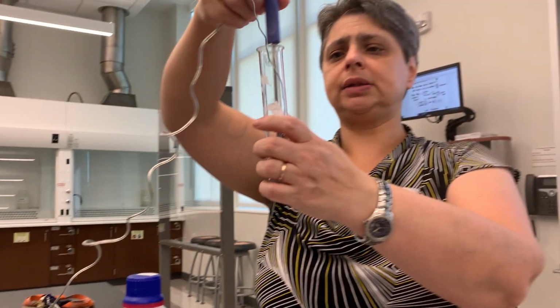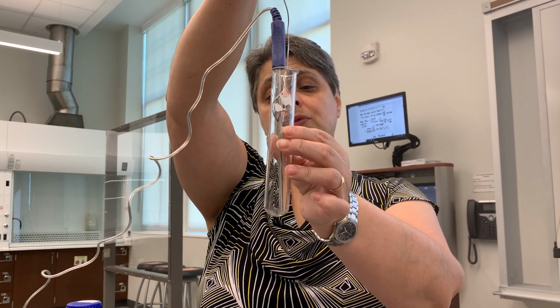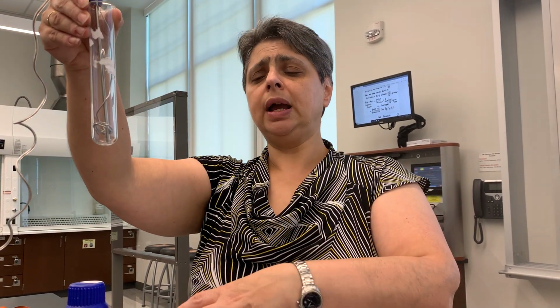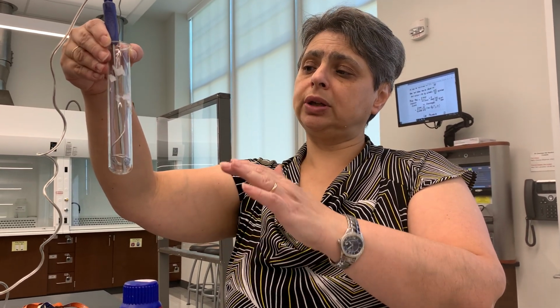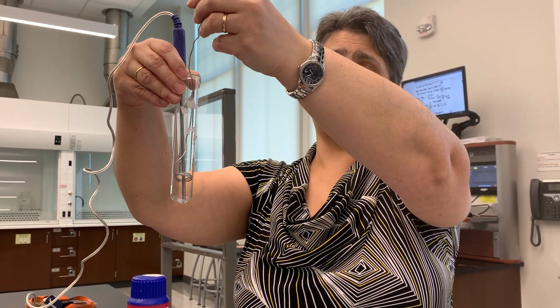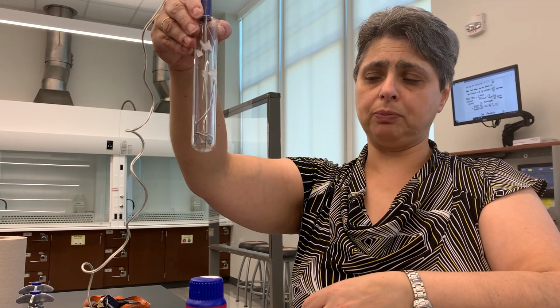So you would place the loop of the stirrer right around the temperature probe like this, and you would lower this whole assembly into an ice water mixture. In fact, for terbutanol, it's basically water maybe with a couple of pieces of ice, so that you can gradually and slowly cool it and obtain your cooling curve right on the screen of the data logger that would be set up in the graphing mode.